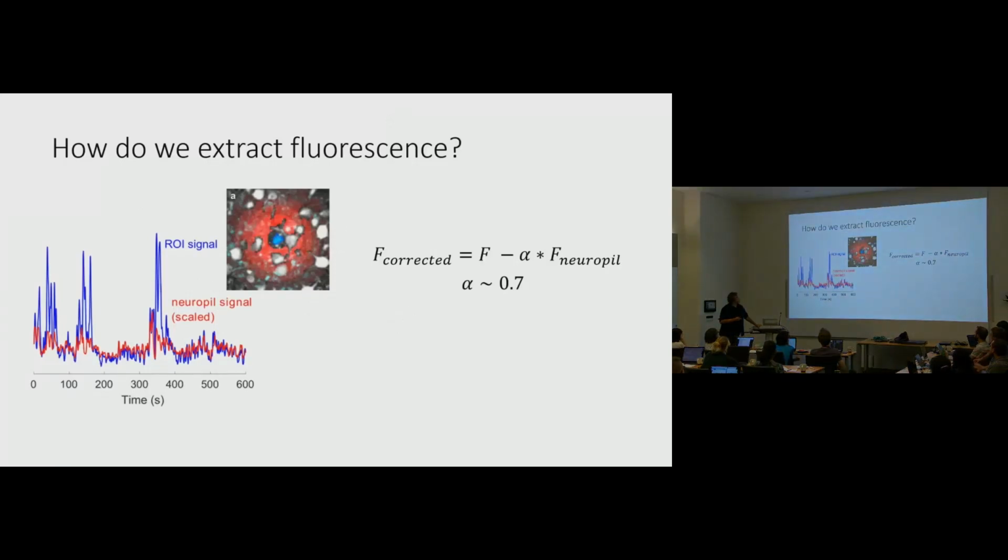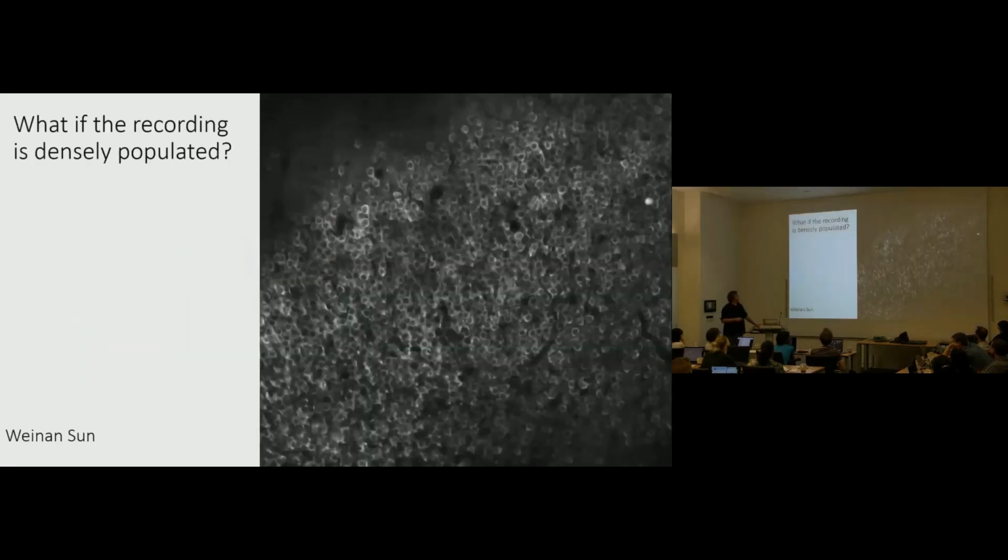We talked about neuropil, and I already gave you this little thing that we're really unsure about how to best correct for neuropil, because we have an absence of ground truth data sets, so we don't have anything to optimize. It's kind of hard. We set it to 0.7 by default. All right, so you can do it on other kinds of data. I think that's all I have for the rest of this, just different kinds of data.